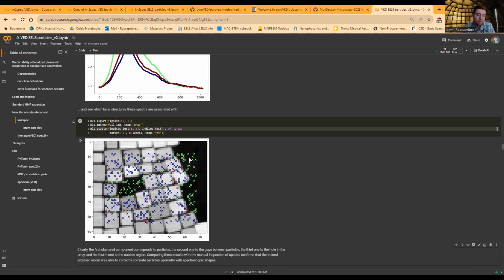That's what's causing these to be much stronger. So it already recognizes that if we're outside of the particle, this is going to be stronger, which makes sense intuitively. But keep in mind that this algorithm doesn't know anything about whether there's a substrate or not. So that's already very neat that it can do that.